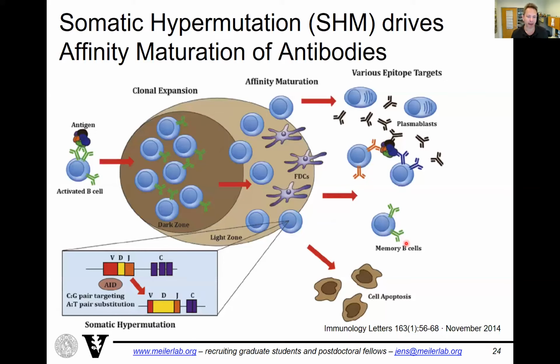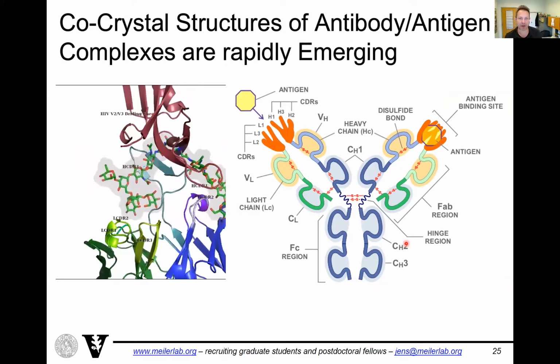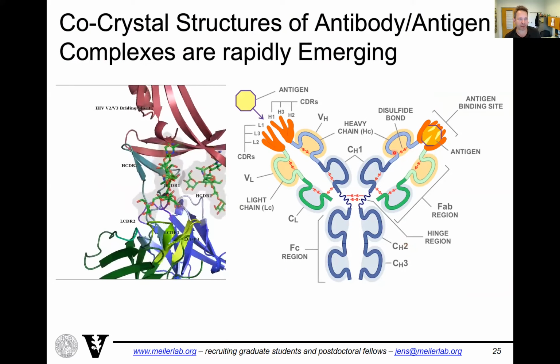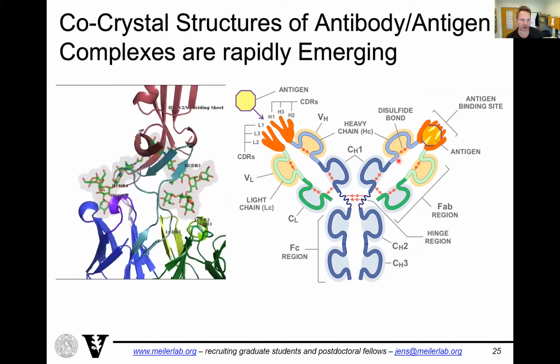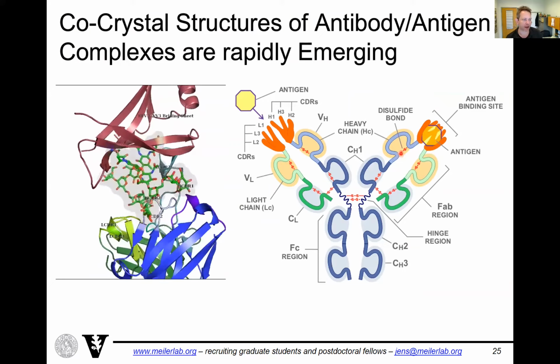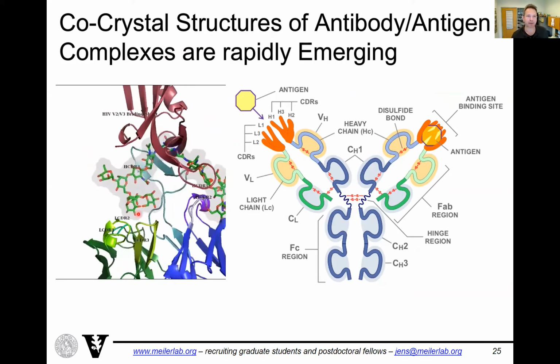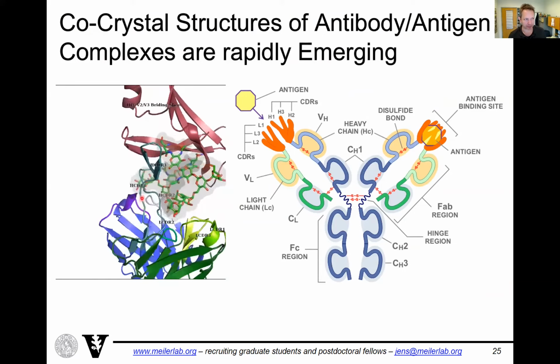mechanism because of time, and also we want to really focus on the actual design. So let's look at a specific antibody, right? This looked kind of very interesting. Now we are looking just at this very tip of the antibody, the complementary determining regions, and the antigen here on the left-hand side, but on a structure. And let me walk you through this.